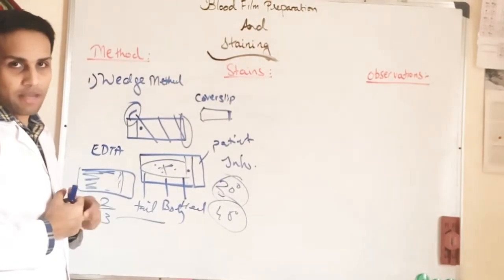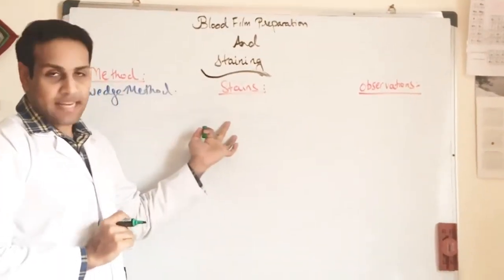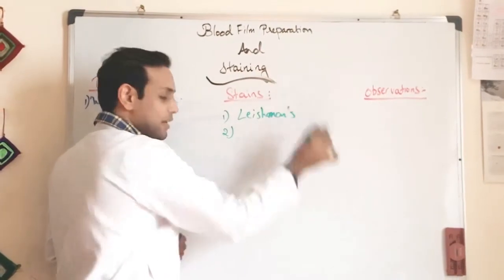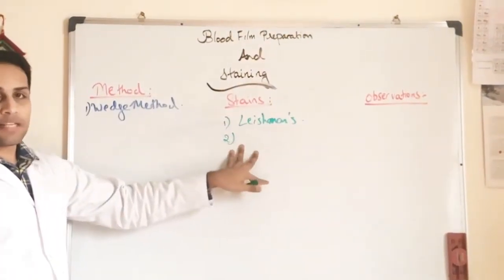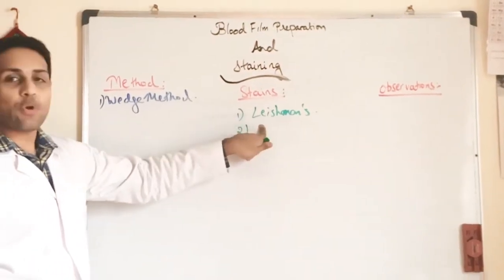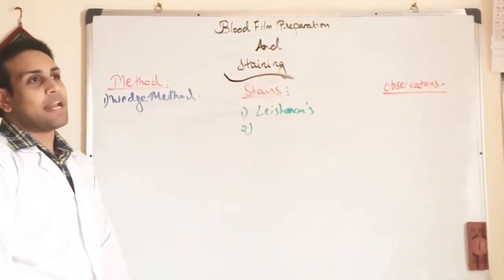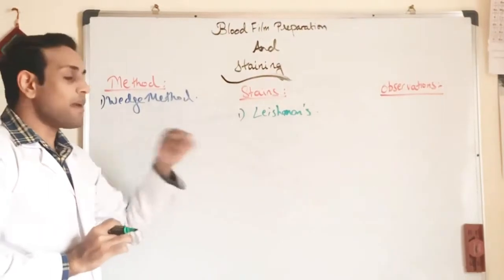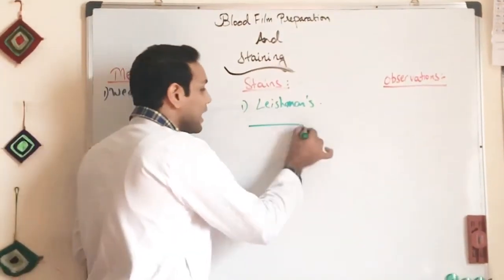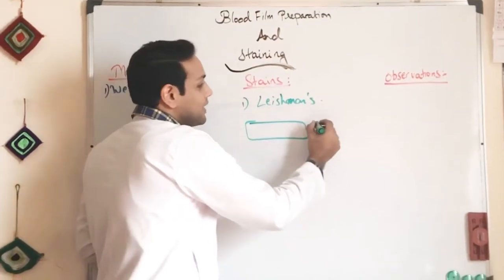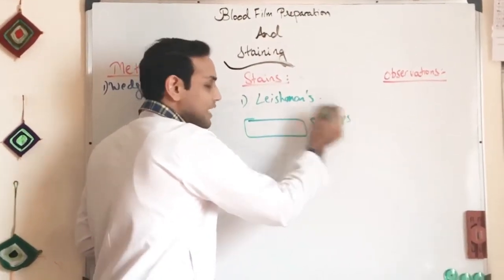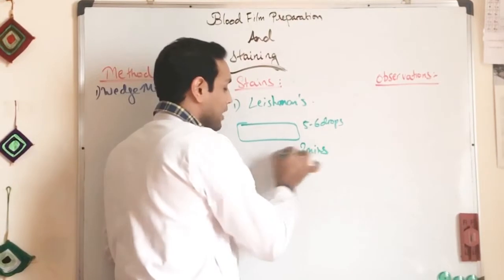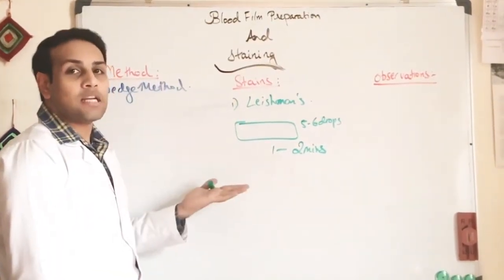Now we move to the staining part. Different stains can be used: Giemsa stain, Field stain, Wright stain. In this practical I am using Leishman stain because it is quicker and simpler compared to others. For the Leishman stain procedure, the first step is to cover the slide with around five to six drops of the stain and leave it for one to two minutes.